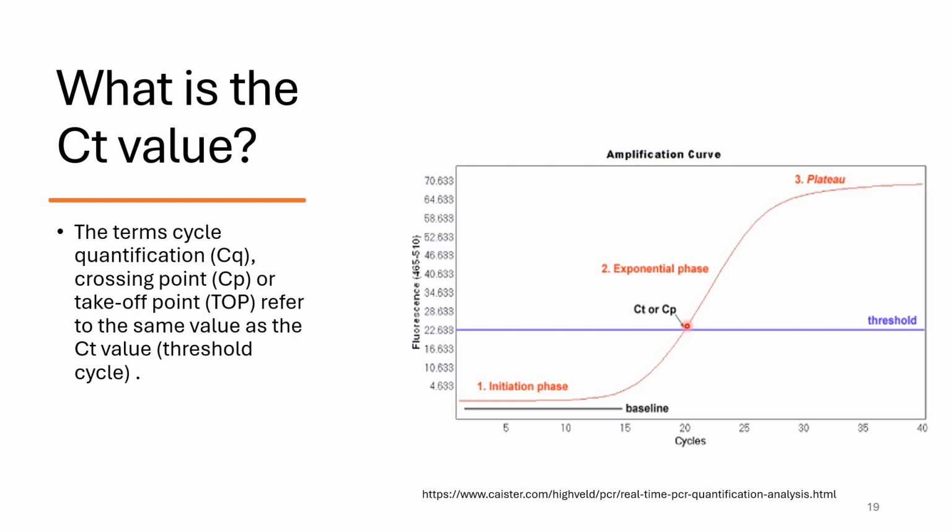The number of cycles needed for the amplification-associated fluorescence to reach a specific threshold level of detection, the CT or CP value, is inversely correlated to the amount of nucleic acid that was in the original sample. The value always is in the exponential phase of amplification, when amplification is most efficient and therefore quantification is least affected by reaction limiting conditions.